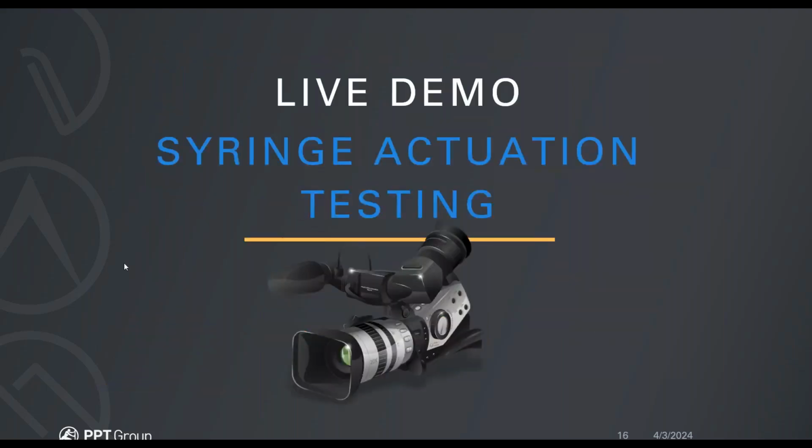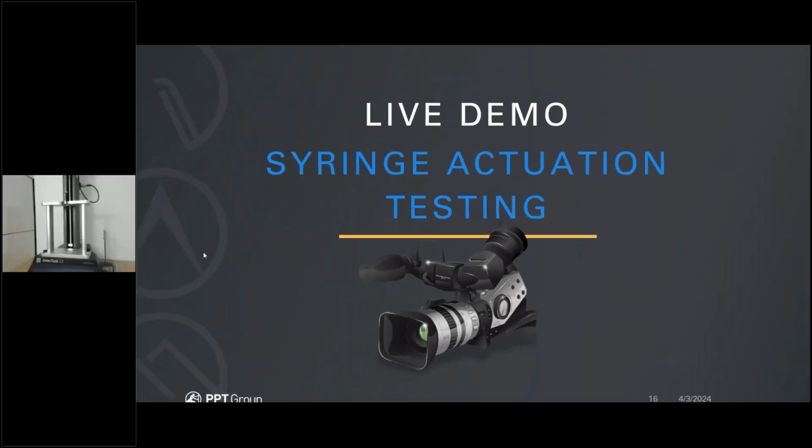So if you give me a second, I will switch to my webcam and kind of walk you through what we are using. So if you can see my webcam, this is essentially our setup. Now, again, the test requires 3 items: the motorized tester, the fixture, and a plunger. The plunger is essentially just a compressive plate that pushes against the actual plunger that goes through the syringe.